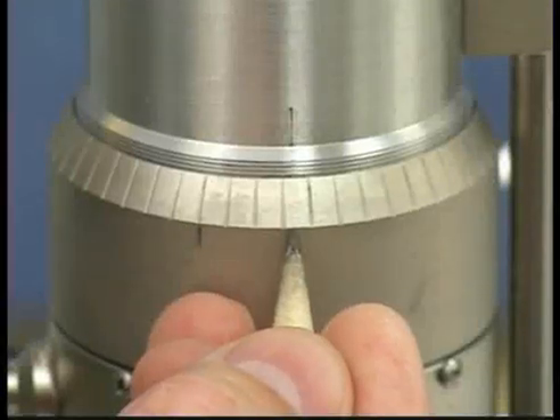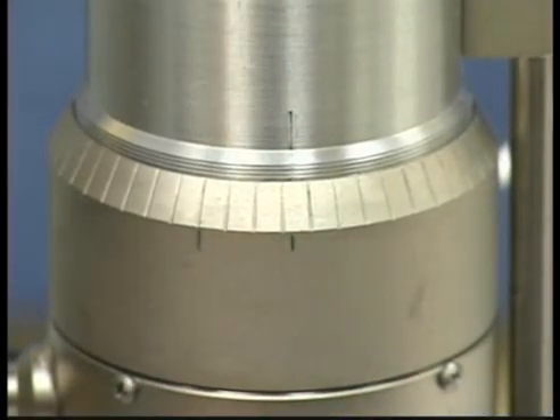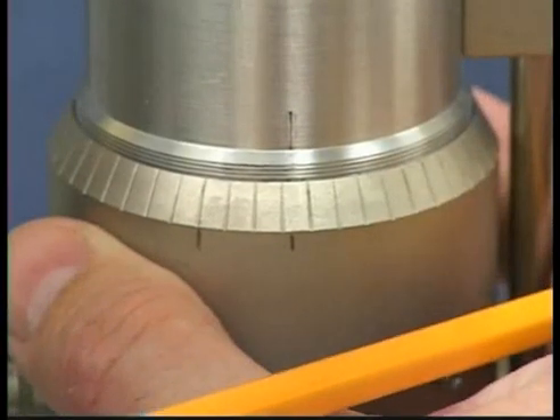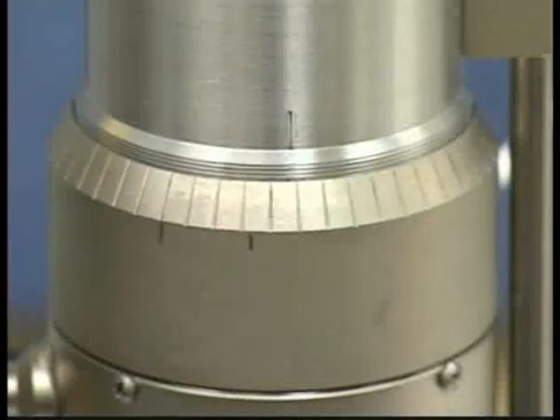Make a pencil mark on the adjustment ring directly under the index mark on the pivot housing. Turn the adjustment ring to the left, clockwise, exactly the width of one division from the pencil mark. The gap is now properly set.